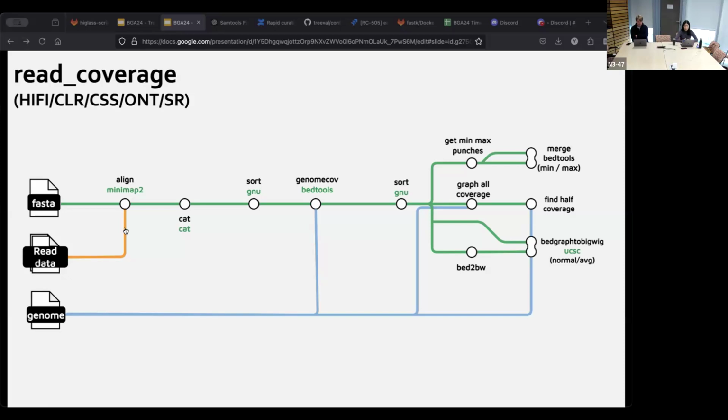We thought about maintaining the user Hi-C file at the original size, but for our production at the moment, because we produce tons of assembly metrics every day, the user Hi-C files take up a lot of memory and a lot of time as well. So for the current approach, we only allow 50 gigs. Yes, you can take the intermediate file and produce the Hi-C map with the full-size BAM if you wish.